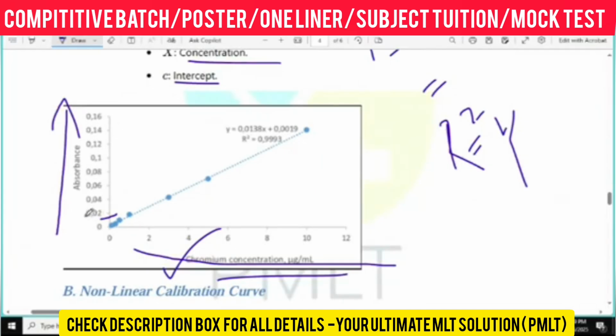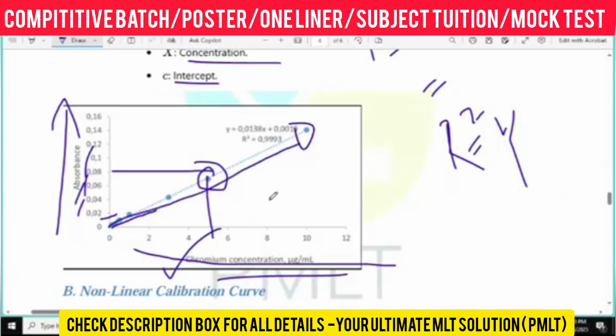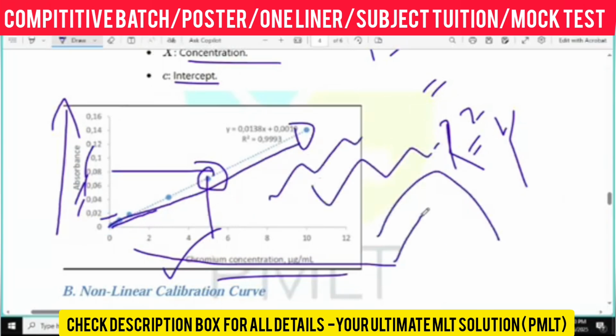The first readings, 0.02, 0.04, 0.06, 0.08, whatever we are getting, we put it here and we have to match it with here. That is the slope, right? And whenever we get this kind of line, we are getting a linear graph. Is there any helical, spherical, round or another shape? No, that is a linear graph we are getting.